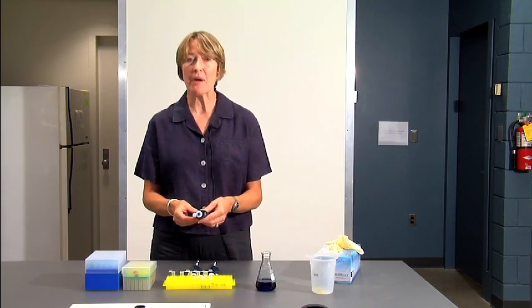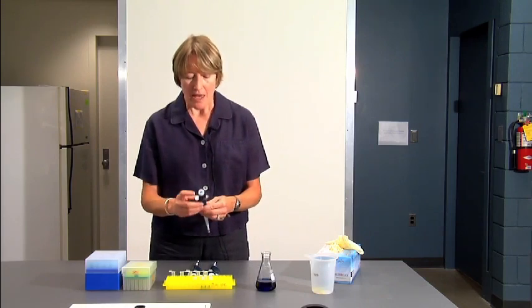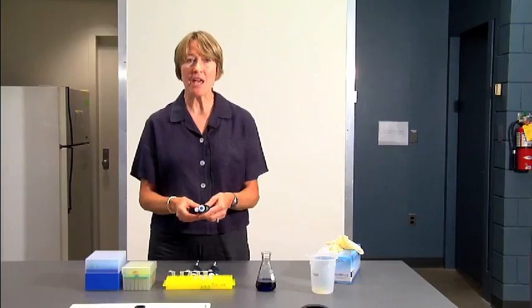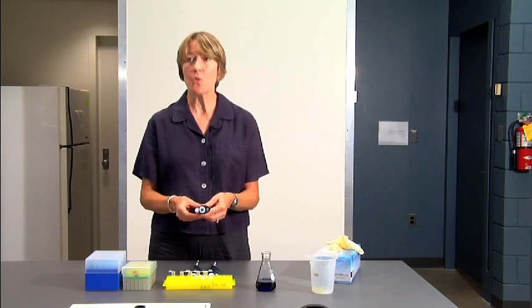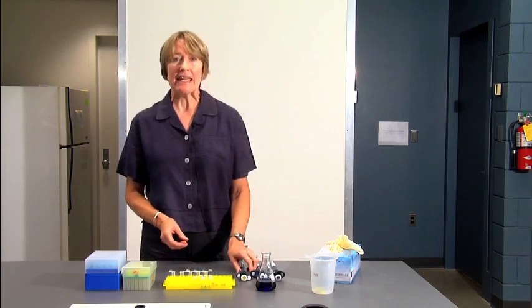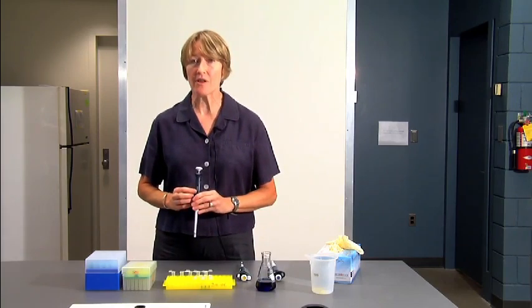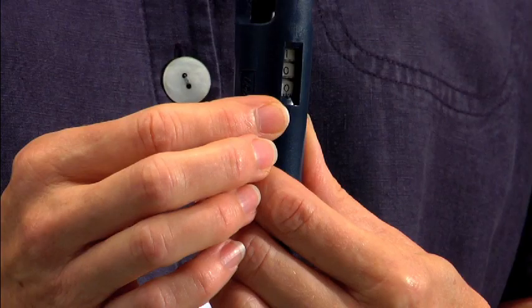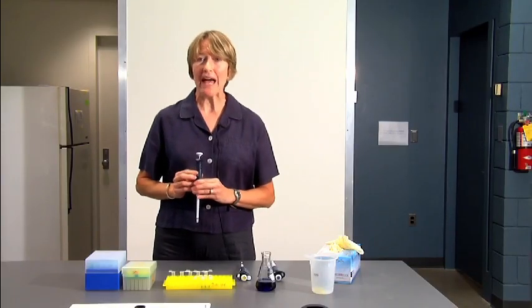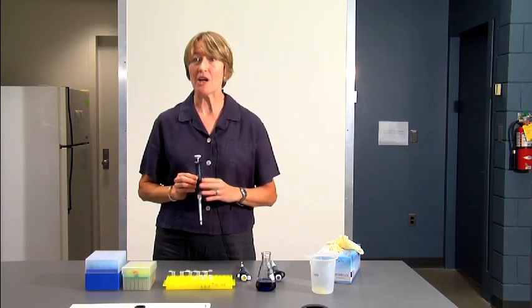The last size micropipette that we'll be using is the P1000. Notice that that says P1000 on the plunger, and it measures 200 to 1000 microliters of fluid accurately. Each of the pipetters has a series of 3 numbers on the barrel. And this is how you set the volume that you want to use. Some of the numbers are black and some will be red. The red numbers indicate that you have to be alert.